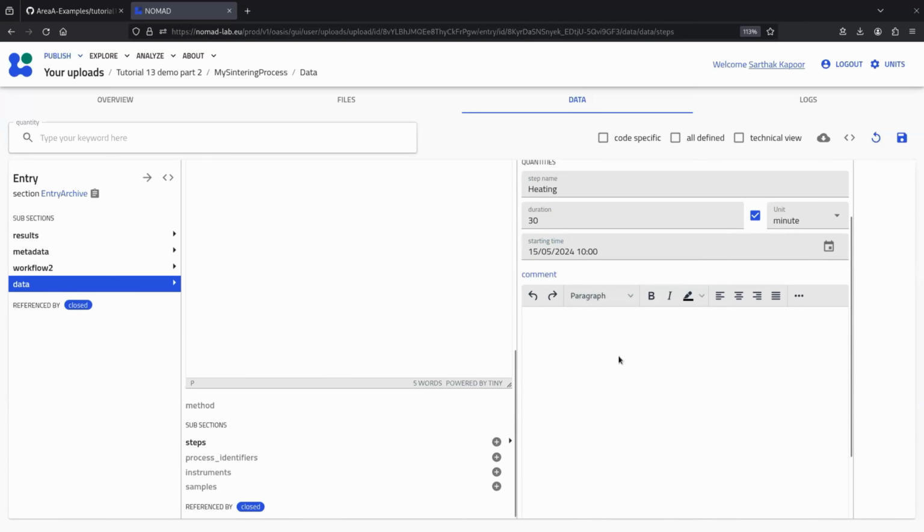And we use the comment section to add a bunch more data, like the initial temperature. We started at, let's say, room temperature, and we have the final temperature as 100 degrees. Of course, all this data is quite fictional, so let's not really think about the data much.